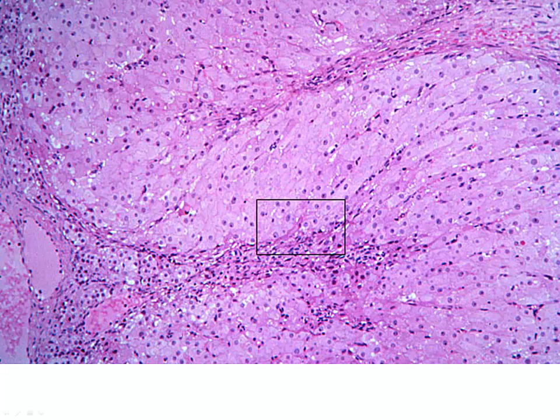Again, here we're looking at the folded nature of a corpus luteum. And as we're looking at these, we can see the connective tissue septum that's driving up. This is going to be our theca lutein cells, formerly the theca interna cells, as they're projecting up. These are going to be, again, secretory in nature. And then here we have our granulosal cells that are the highly folded nature. And again, you can see the secretory vesicles present in these folds. These, again, are our progesterone factories.